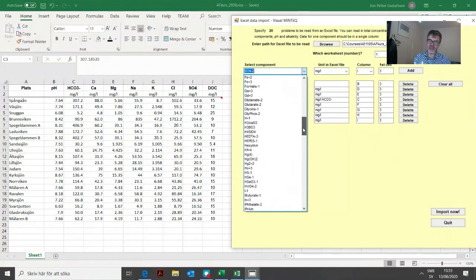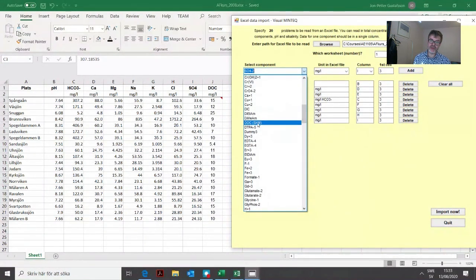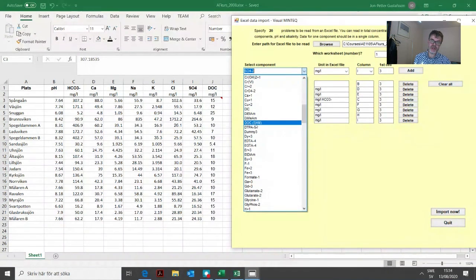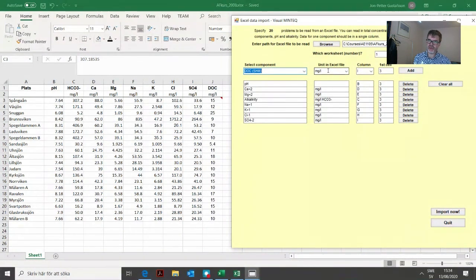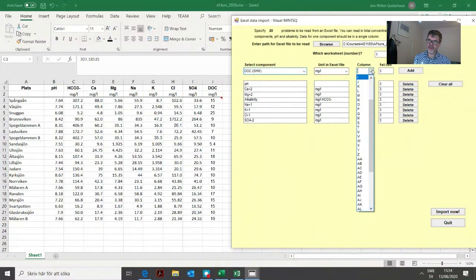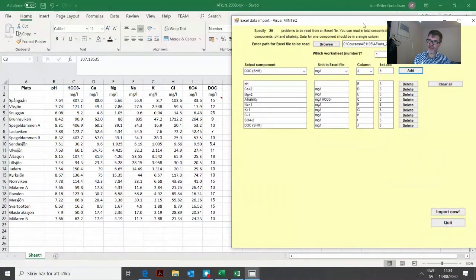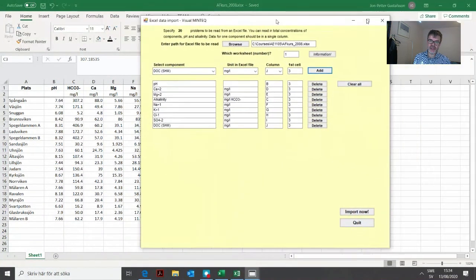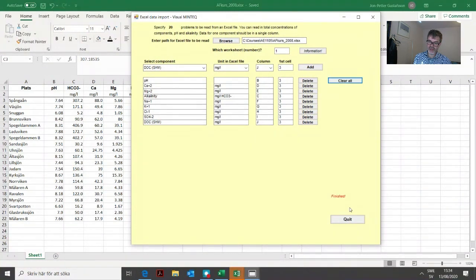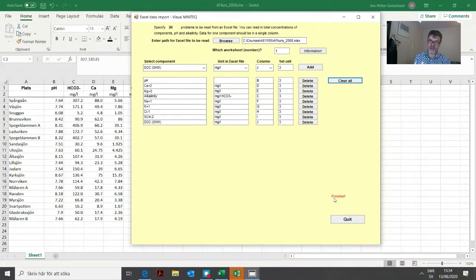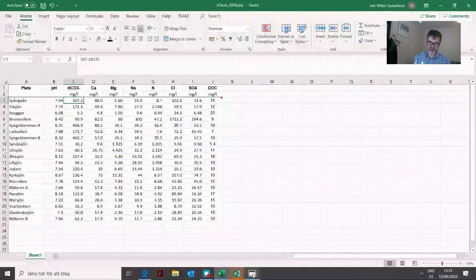Finally in the last column we have DOC. Because we defined the SHM model, that's the one that pops up here. It should be milligrams per liter and it's column J, then we add that. Then we just need to import. If everything goes well, you get this red text showing it's finished. Then we click the quit button.